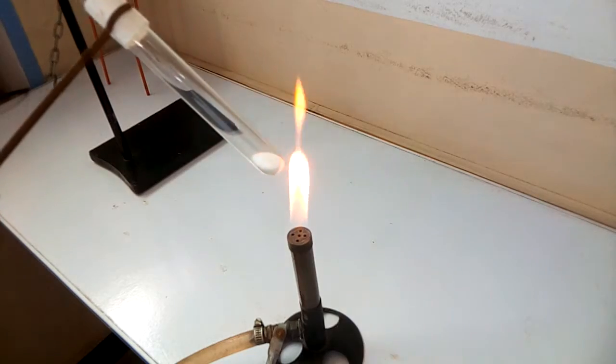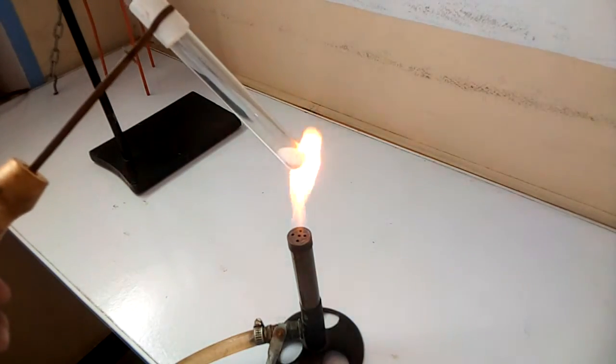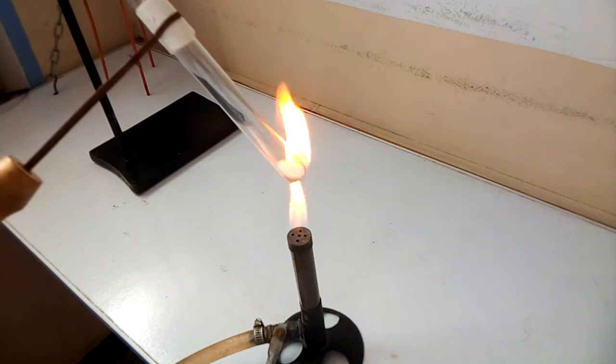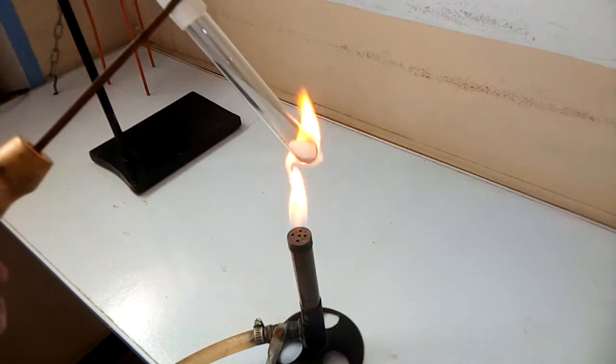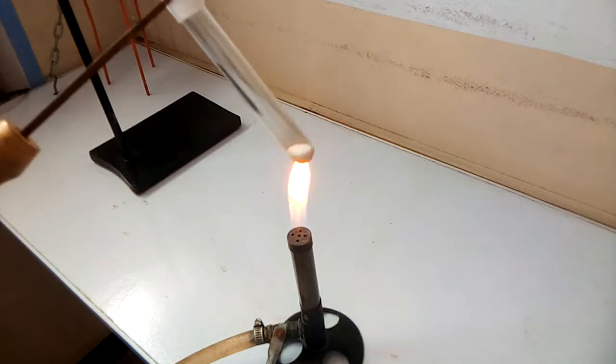We have taken 5 grams of ammonium chloride in solid form into the test tube. Now we will heat the test tube containing solid ammonium chloride gently over the burner with a to and fro motion like this.